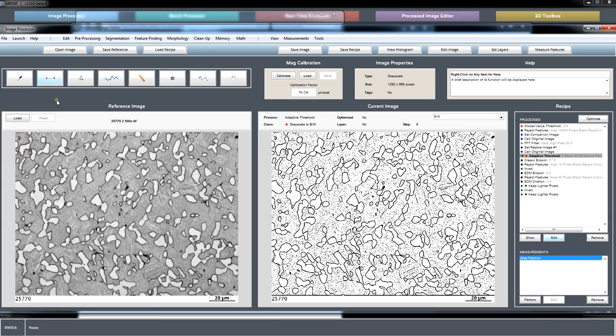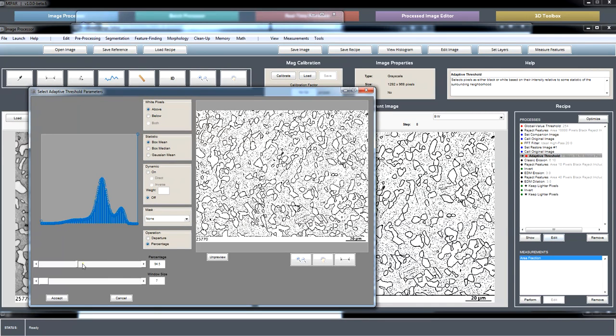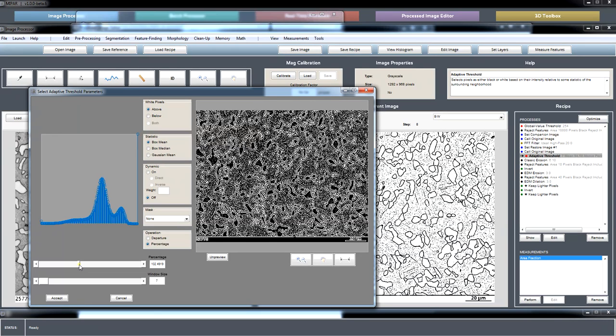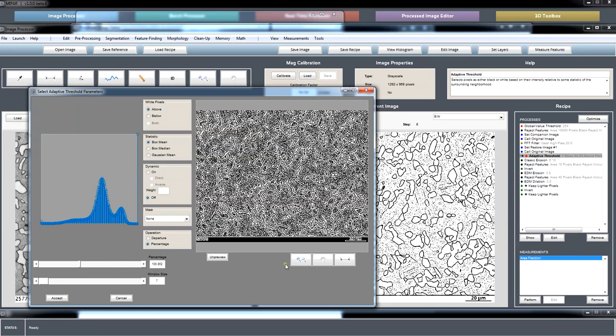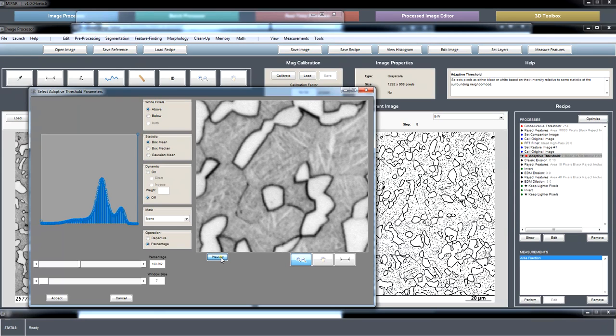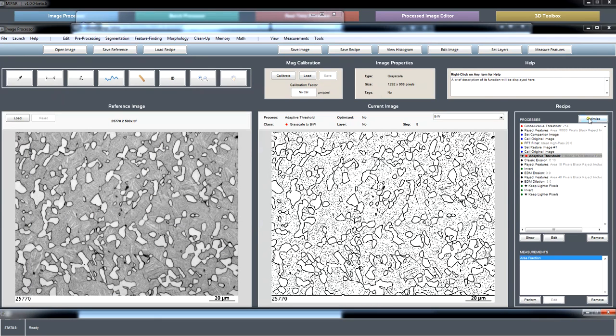Let's go back to this here, and what I would probably have wanted my percentage to be was somewhere up in this. I mean, this is going to be a very challenging image altogether in that the lats are not necessarily that resolvable, but we still should be able to do a better job than we did.